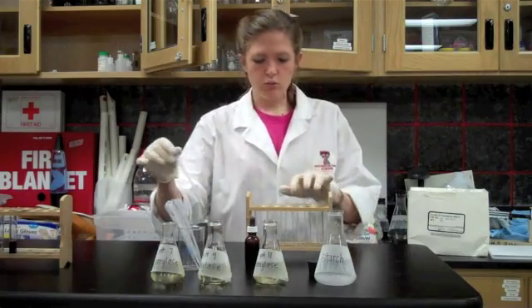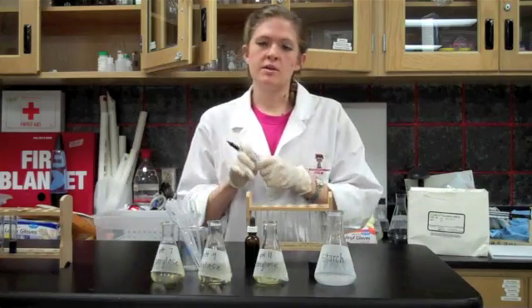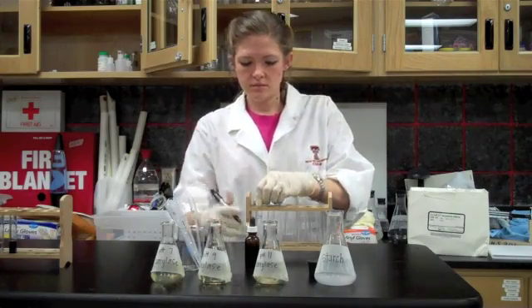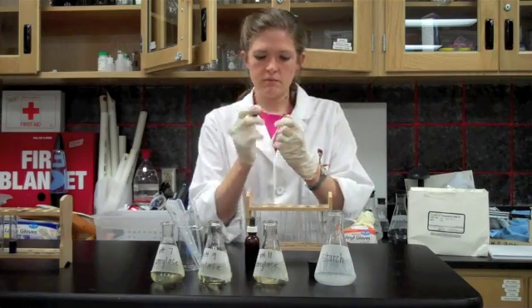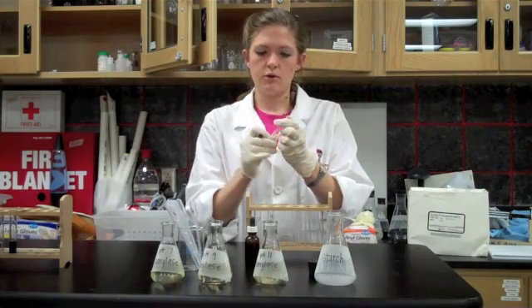Now we're going to take three of the test tubes and label them for the amylase solutions. We're going to take one of them and label it seven for pH of seven, label one nine for pH of nine, and the last one will be labeled 11 for a pH of 11.